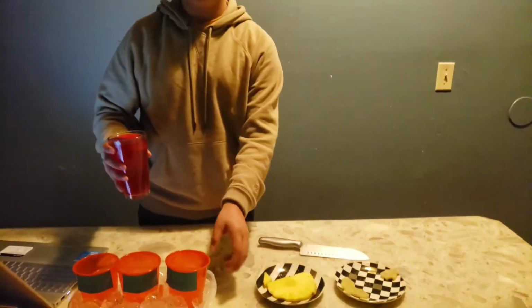I'm now going to put the gelatin into each cup, labeled as fresh, canned, and no pineapple.